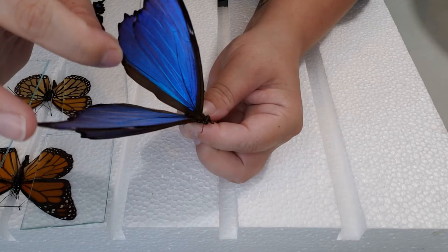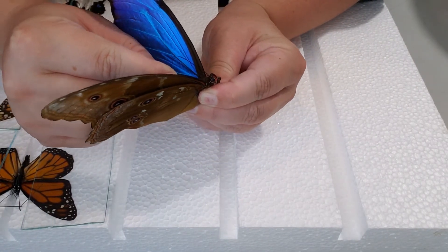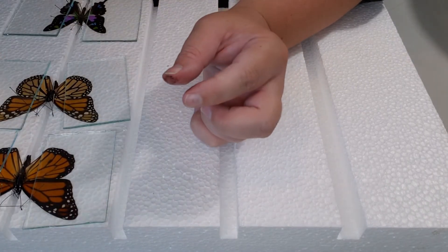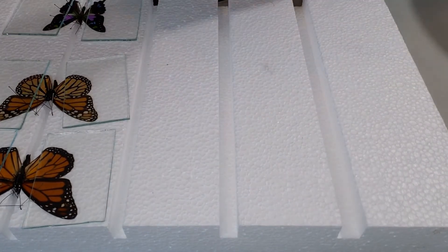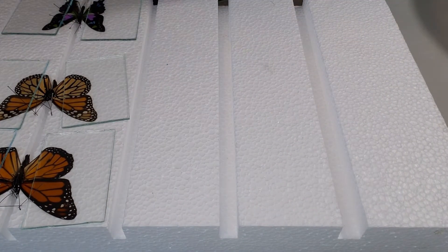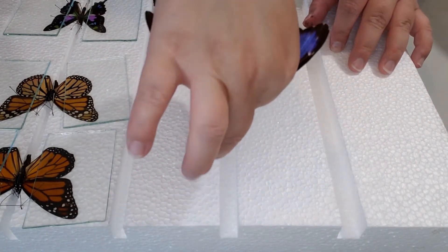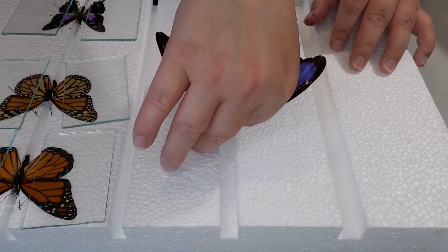Other than that it's the same routine — pinch that abdomen. With these you really, really want to pinch the abdomen. You will sometimes feel, when you're using your forceps to spread those wings downwards, a little bit of cracking. So pinch the abdomen pretty hard while you're doing that spreading downwards to prevent them from breaking.